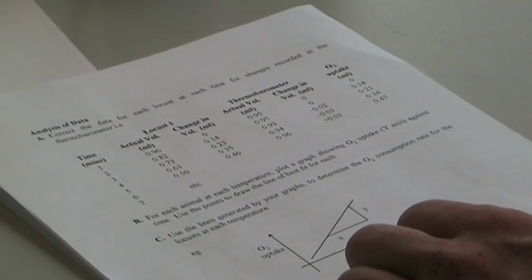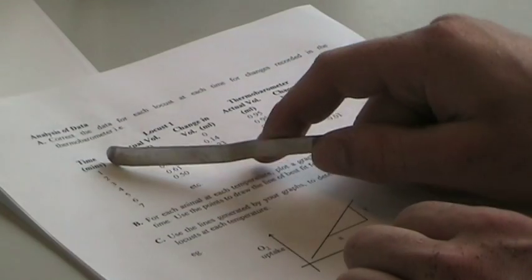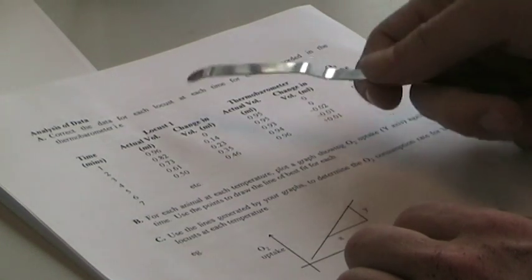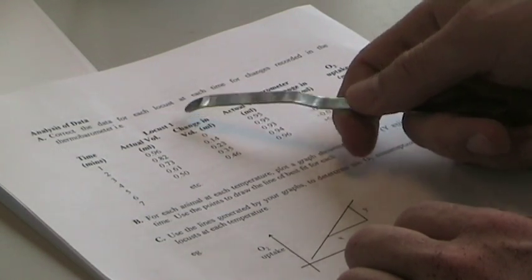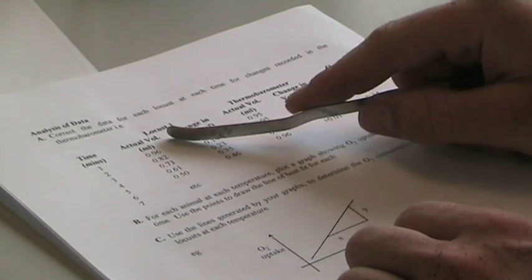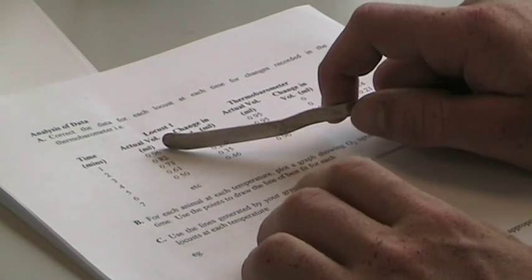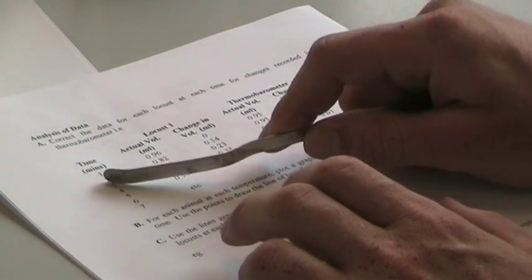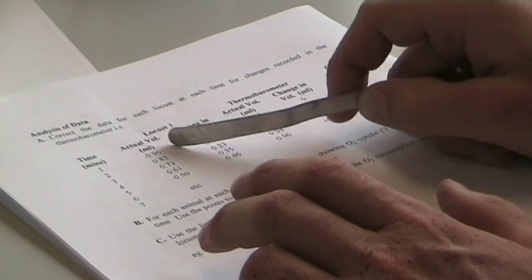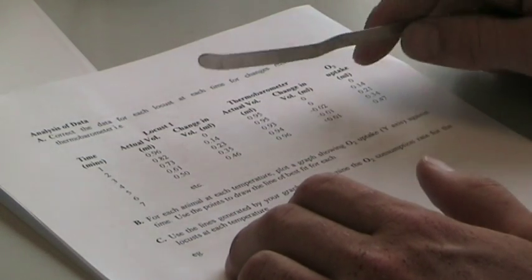Once you've gathered the data, you construct a table similar to this. Here you have your time in minutes at which the data was taken. You would then record locust 1 followed by the thermobarometer. Here in the actual volume for locust 1, you write down where the meniscus was at that time. So here it was 0.96, 0.82, 0.73. It's going down because oxygen is used by the locust.